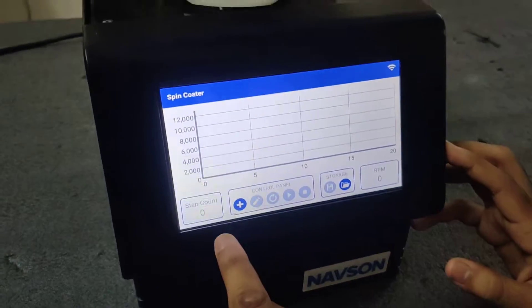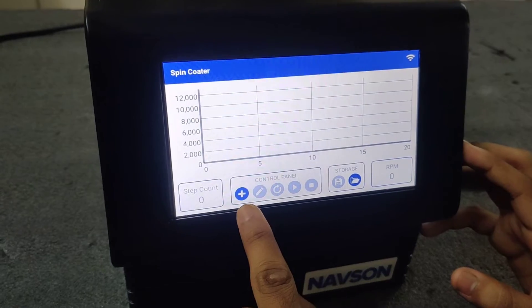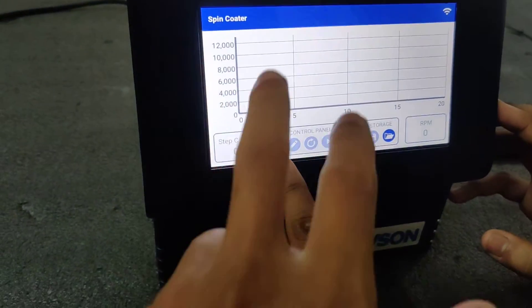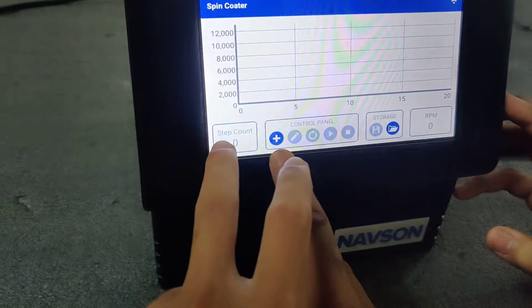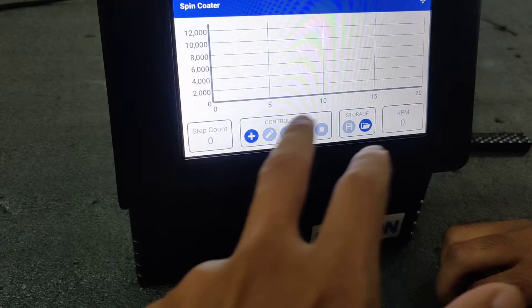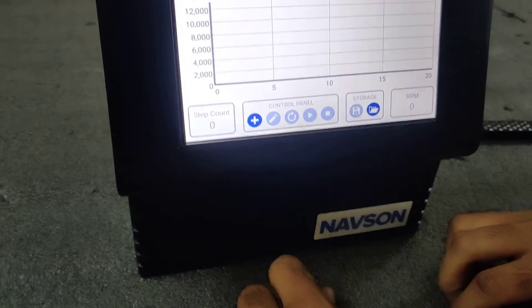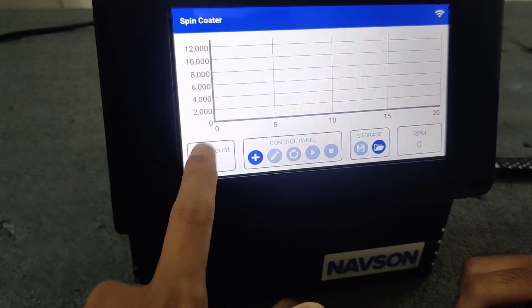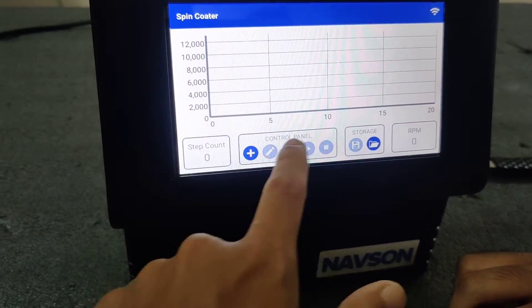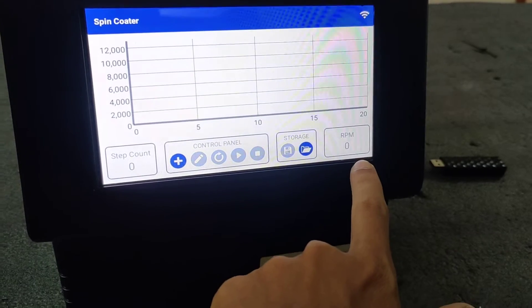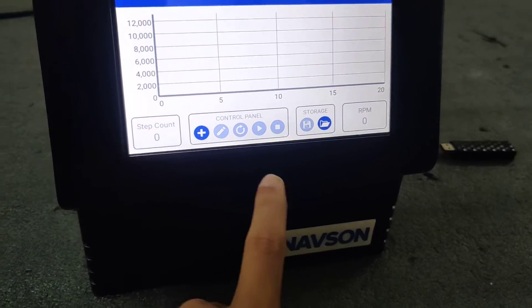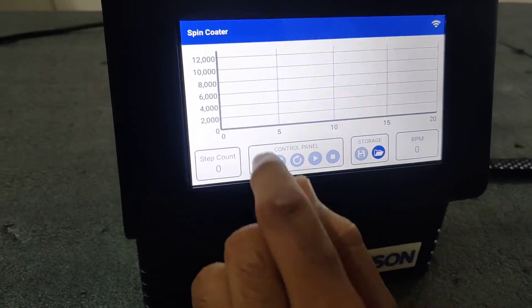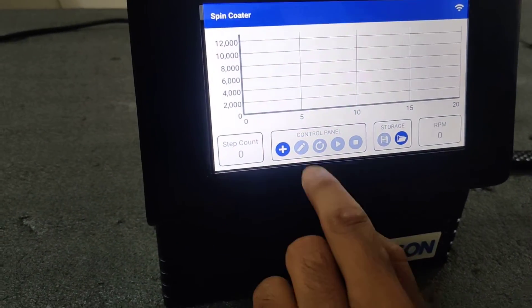So this is the display, this is the main interface. This is the RPM, Y-axis is the RPM, X-axis is the time. This is step count, how many steps you are using. This is the live RPM feedback. So let's add programs.